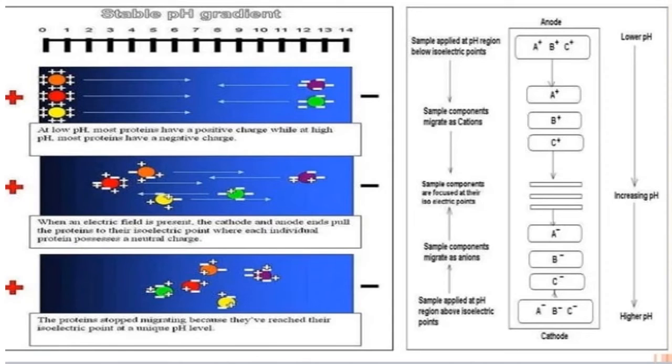So now let's try to track how one molecule is moving. Let's start with the orange one. From the first part, where we are seeing those three proteins on the anode, they have about 1, 2, 3, 4, 5, 6, 7, 8 positively charged particles each. They are positively charged, and the charge is positive 8. So now that orange one is moving. Let's try to observe the movement. It's moving towards the what? The cathode.